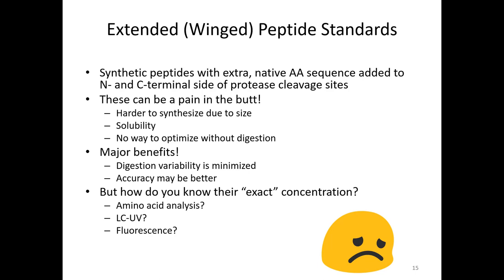Yeah, so if they say 95% purity or 98% purity, for a company like that, do you think they do enough QC for you to be relatively confident that you're looking at 980 micrograms of your peptide? When you start, that's when I would have the highest confidence, but then as that thing sits in my freezer and I pull it out, thaw it, aliquot it, put those in the freezer, do any kind of dilutions, the clock starts ticking.